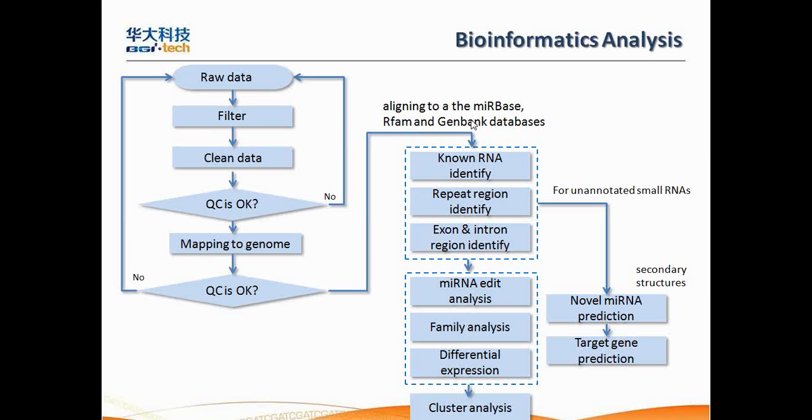We can detect all those known RNAs, and also detect whether these small RNAs are located in the repeat region, the exon region, or the intron region.